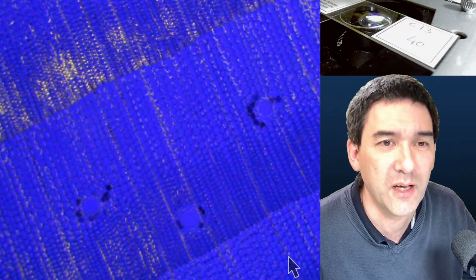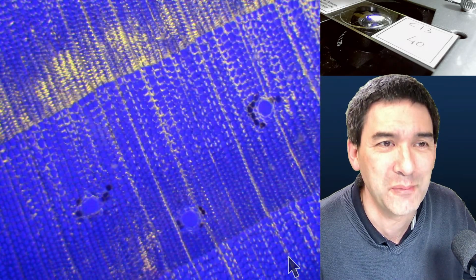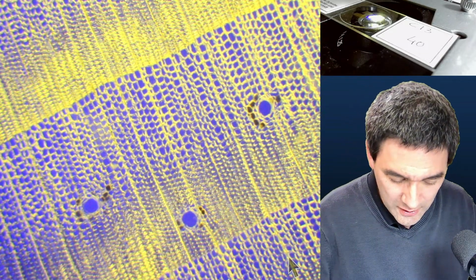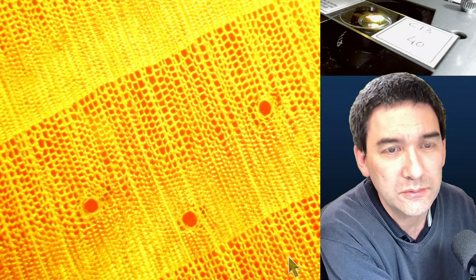See how some cells start to light up first before the others? That tells you something maybe about the ability to reflect the light. But you know what? Why not try? I didn't try that yet. What about red-yellow? Let's see how red-yellow works. Yeah, that's red-yellow.